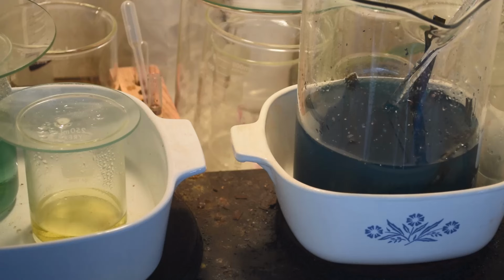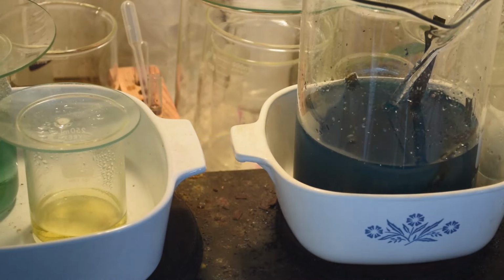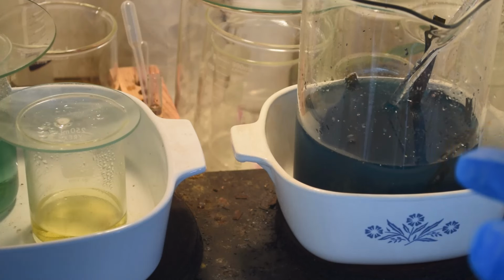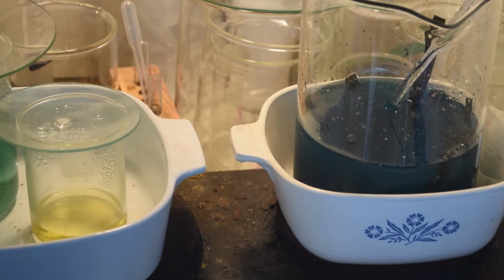Yeah, I was reading Hoke's book on palladium overnight, and I came to the conclusion I'd completely done it wrong here. It was a good test, but not the way to refine it. So anyway, let me get set up to get this blue-green liquid off of this stuff, and then we will move on to physically separating the palladium from the waste.